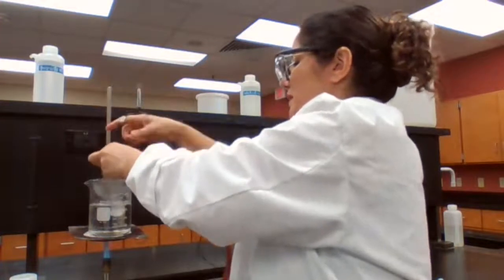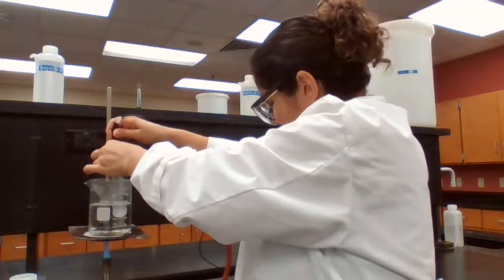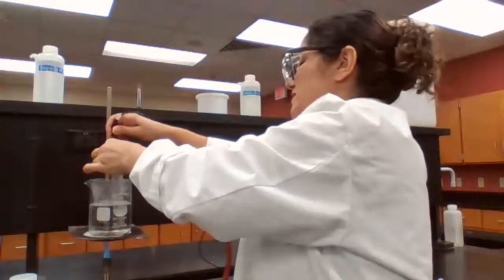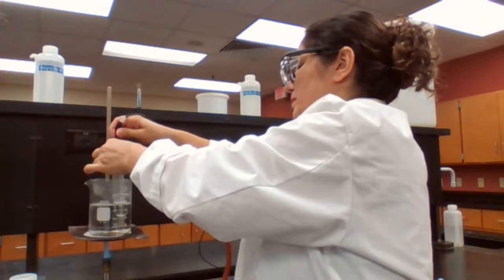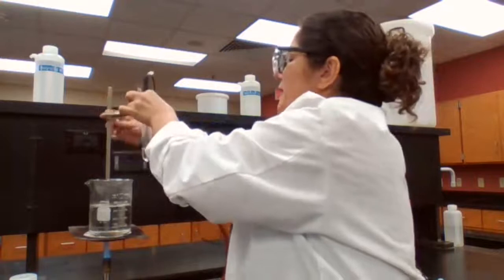Just want to get it high. But it has to dissolve. Okay, it dissolved completely.